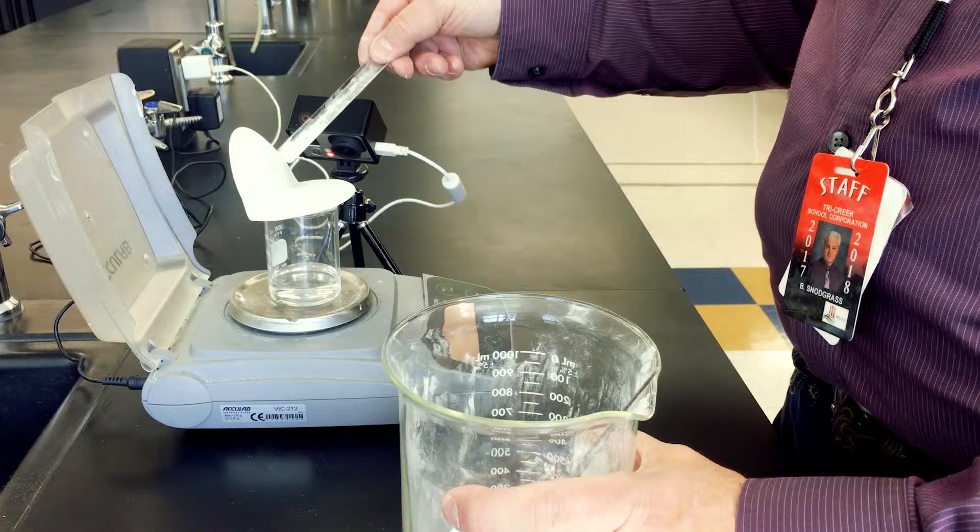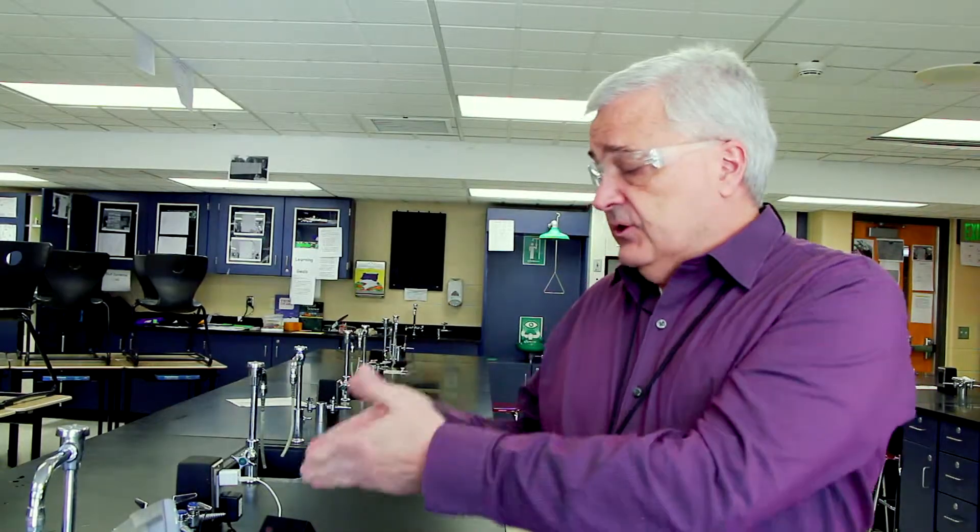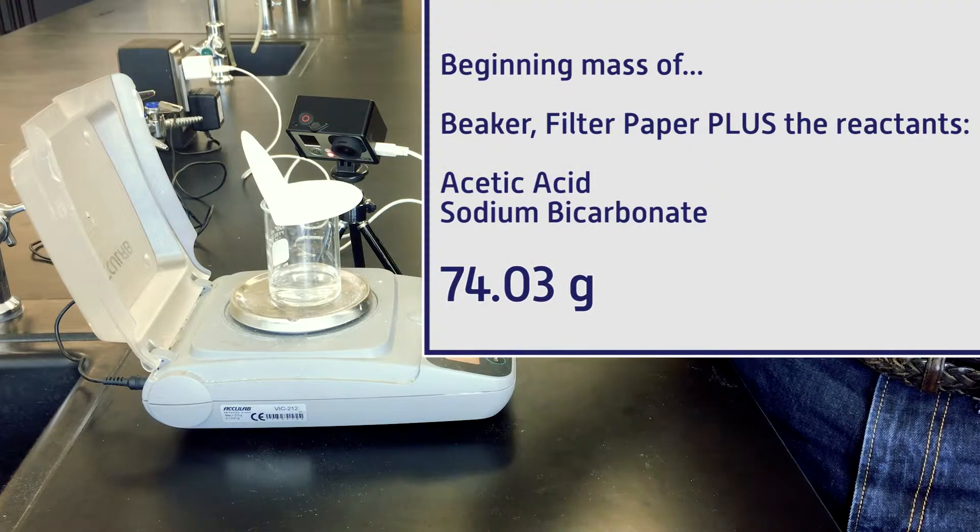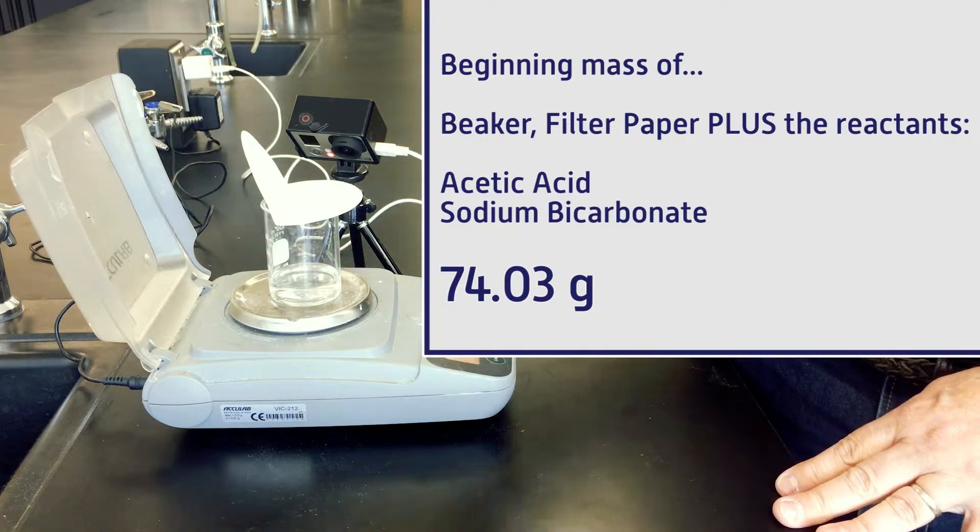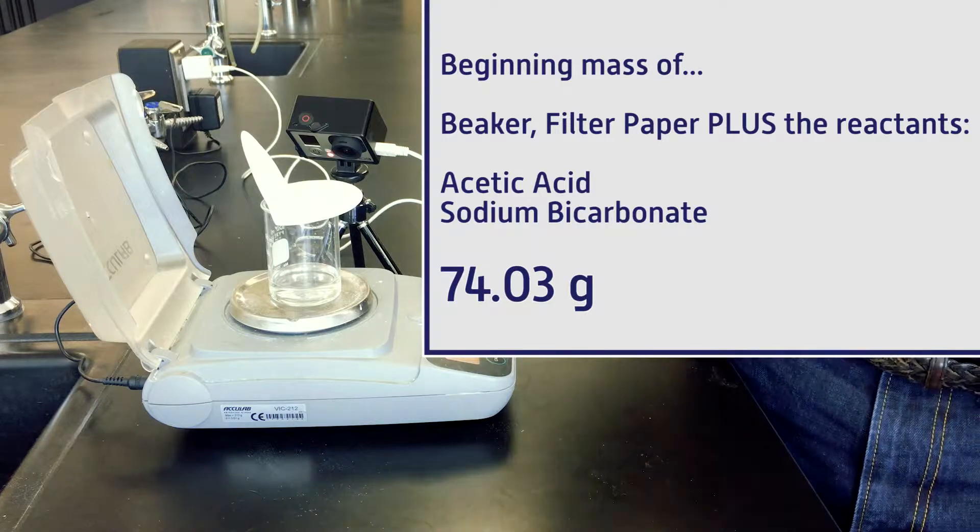Taking into account the mass of the beaker, the amount of the acetic acid, and the mass of the filter paper, the beginning mass of all of the reactants—the sodium bicarbonate and the acetic acid, plus the filter paper in the beaker—is 74.03 grams. So 74.03 grams is our starting mass.